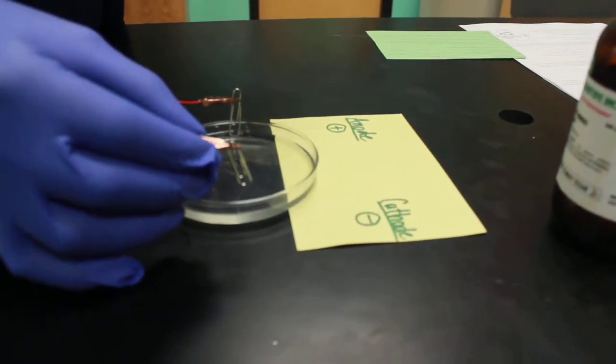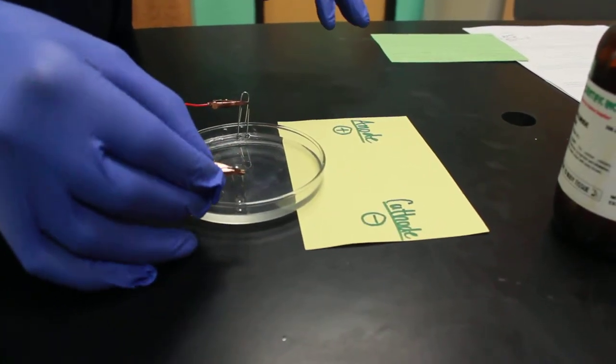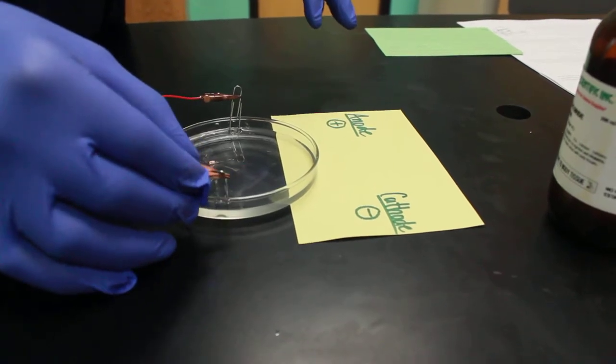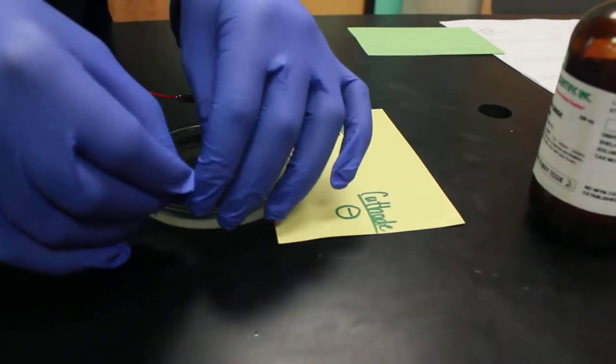Now you're going to take the cathode, which is the negative end, and you're going to put it onto another end of the petri dish.